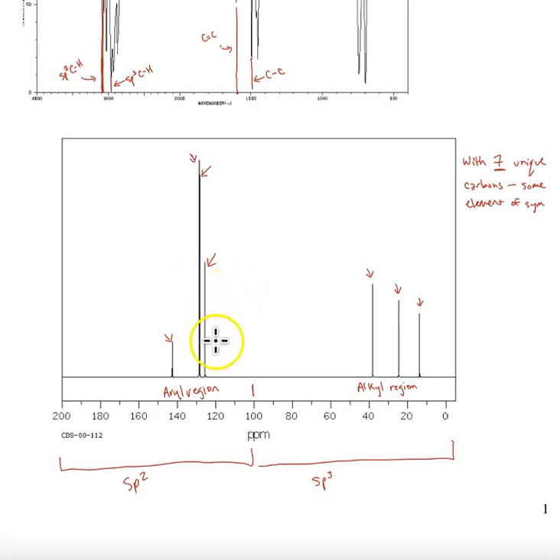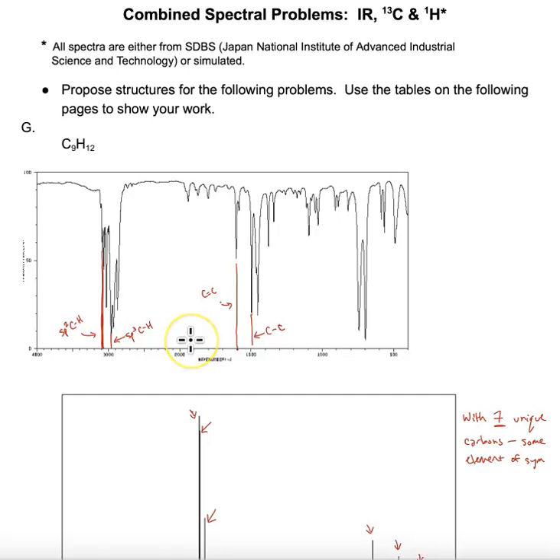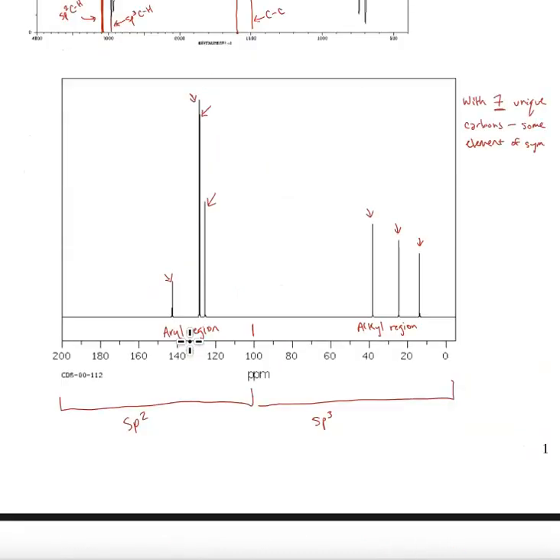So if 2 carbons are in a chemically identical environment, there will only be 1 signal present. Counting our signals, we originally have 9 carbons. I see 1, 2, 3, that one snuck in there, 4, 5, 6, 7. So I'm already thinking there is a degree of symmetry somewhere within our molecule.